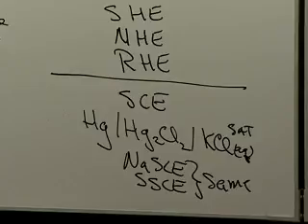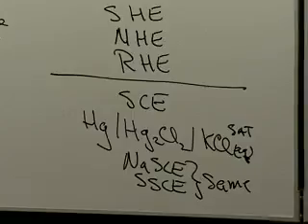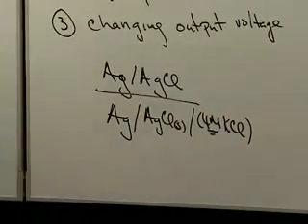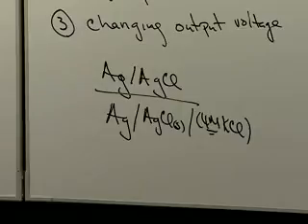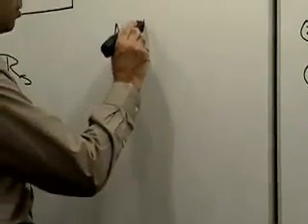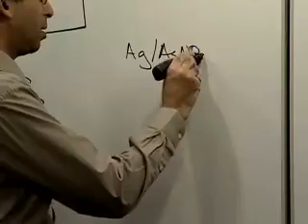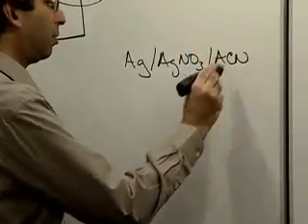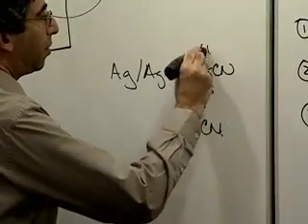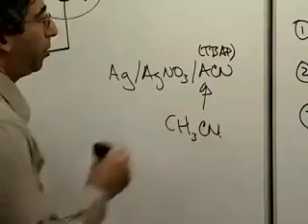Another issue you can run into is you might decide that you do not want to do your electrochemistry in water. In fact, you want no water around because whatever molecules you're interested in are going to die if they see water. And of course, all of these are aqueous systems, so that is an issue. The typical way of getting around that issue is to switch over to a silver nitrate in acetonitrile reference electrode, usually with something like tetrabutylammonium perchlorate as a supporting electrolyte.